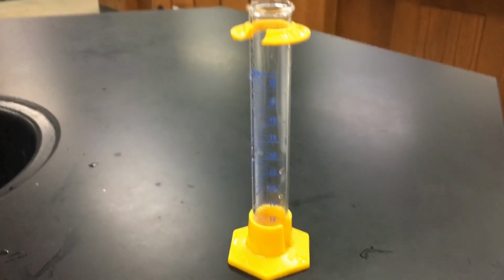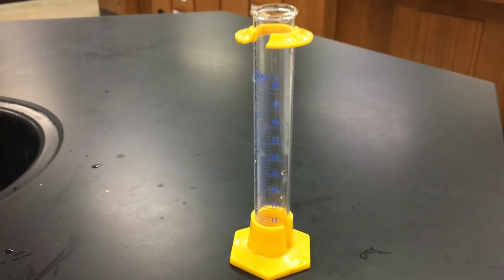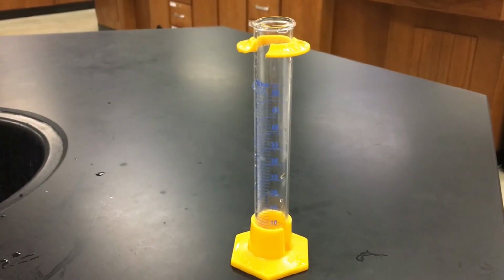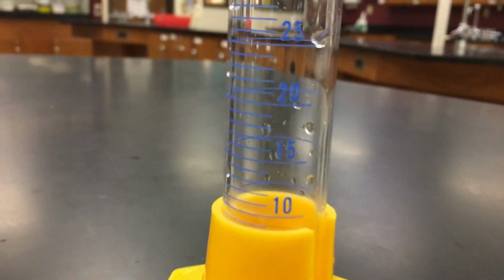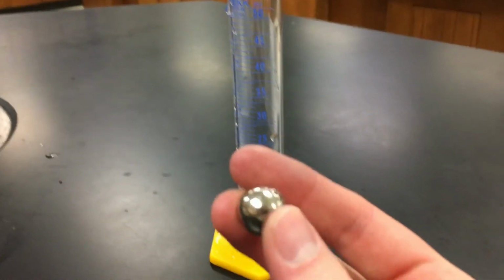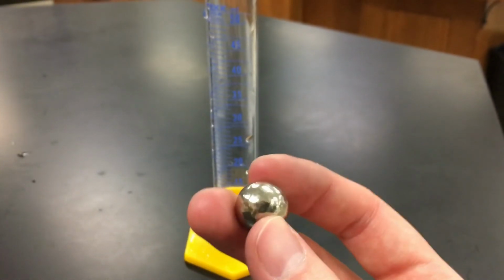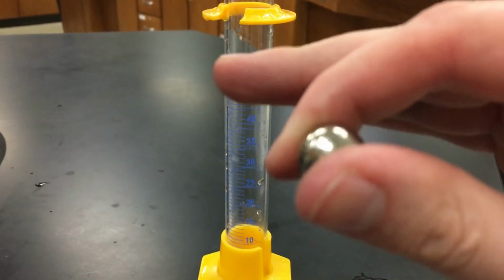So if I want to get a better measurement of the volume, something I might do is use a graduated cylinder like this. Now, graduated cylinders are great for measuring the volume of liquids in milliliters, where the big lines go up by 5, so 10, 15, 20, and each little line goes up by 1, so 25, 26, 27, 28, 29, 30, and so on. Now, this nickel marble is not a liquid, but I can show how much volume it pushes out of the way of a liquid if I put the liquid in first, look at where I start, add the marble, and then see how much that liquid level rises.